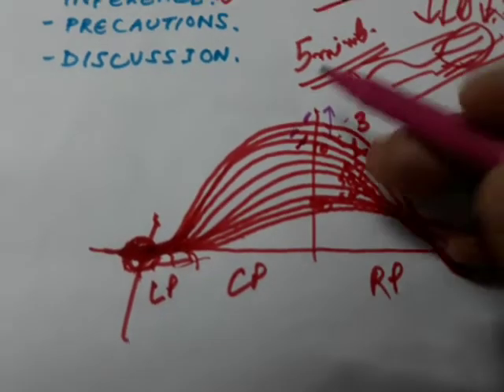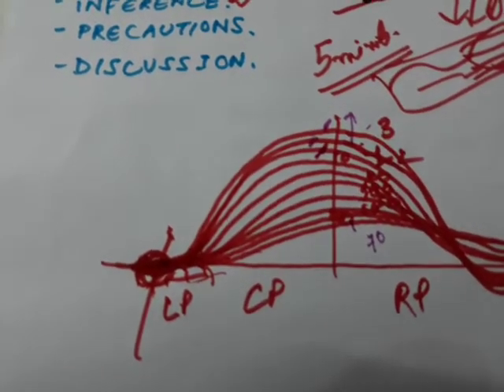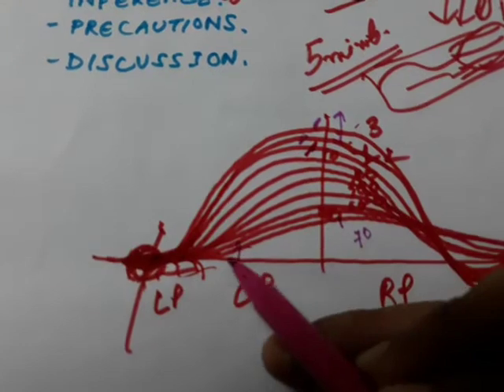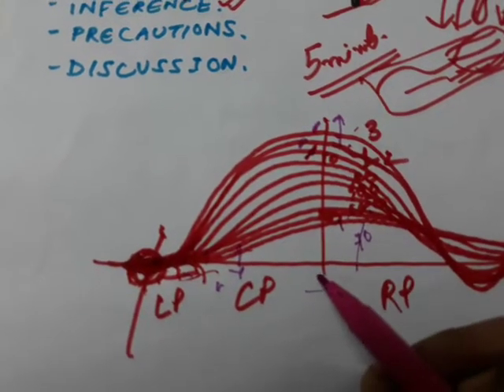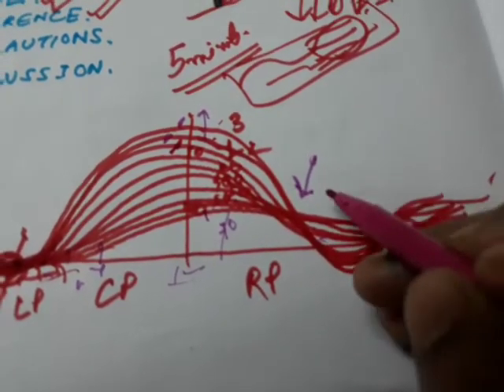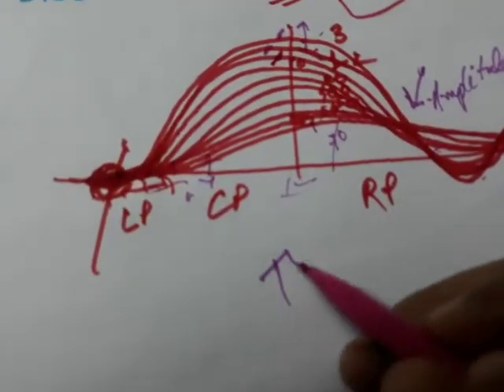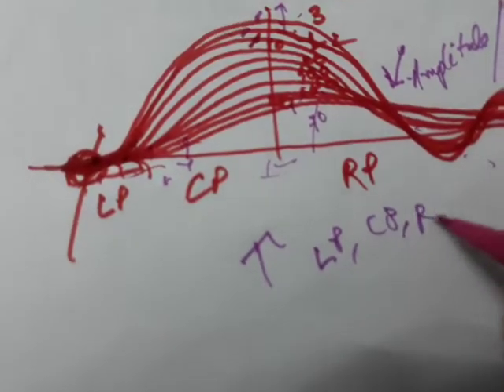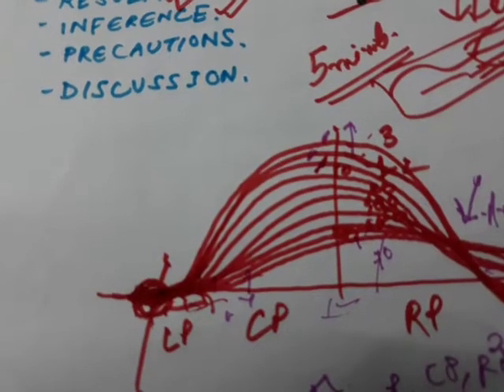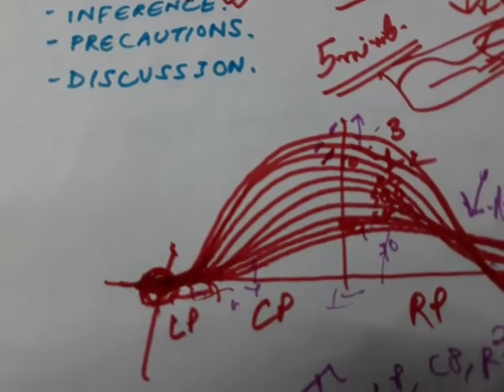Now with the subsequent stimulation, the 10th, 20th, 30th, my curve went up to the 70th stimulation. It was seen that there was a progressive increase in the latent period, the contraction period and the relaxation period, but also a decrease in the amplitude or height. As stimulation is continued, there is a progressive increase in latent period, relaxation period and contraction period, and a decrease in amplitude.